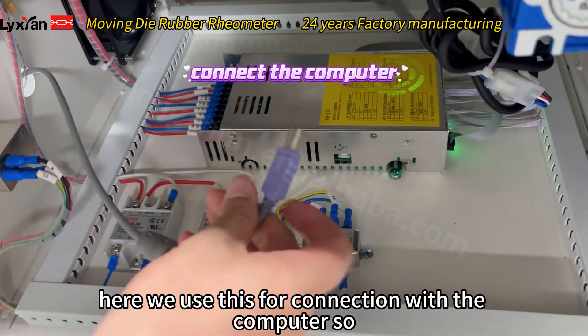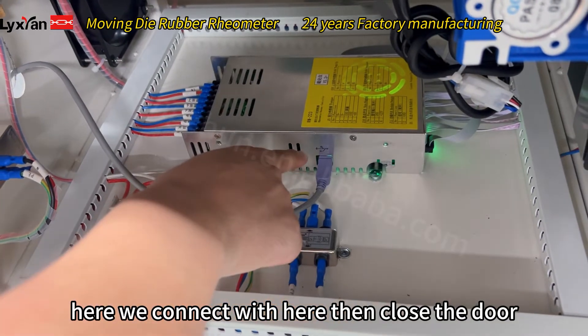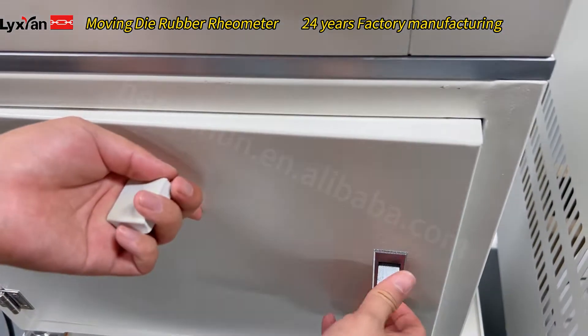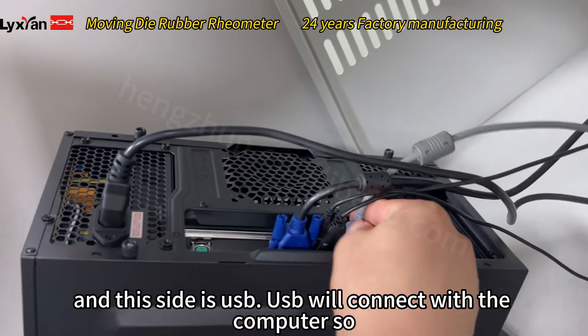Here we use this for connection with the computer. So here, we connect with here, then close the door. And this side is USB — USB will connect with the computer.